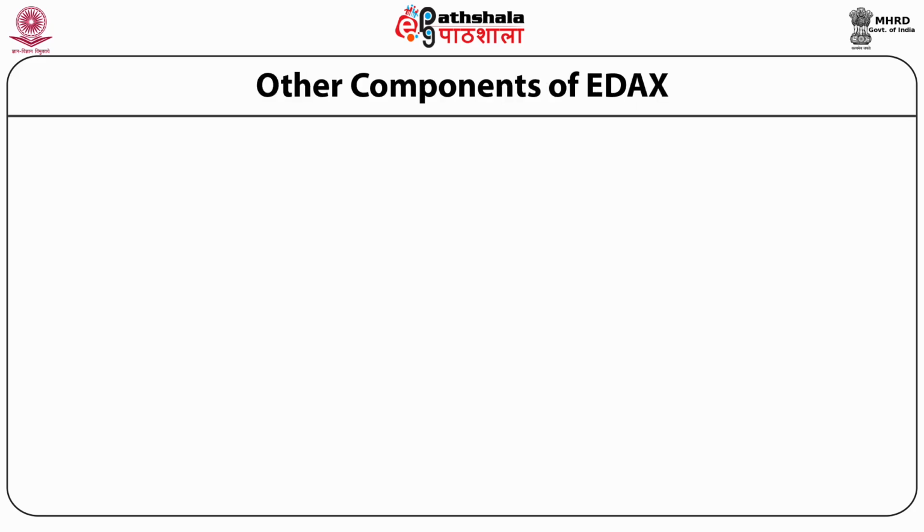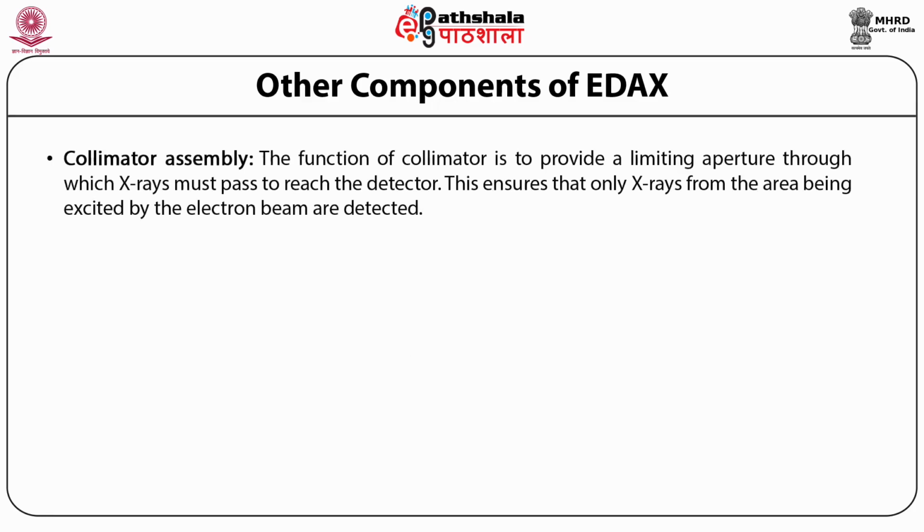There are other components of EDX that play an important role in the working of EDAX. Number one is the collimator assembly.